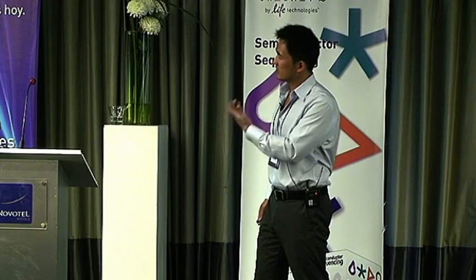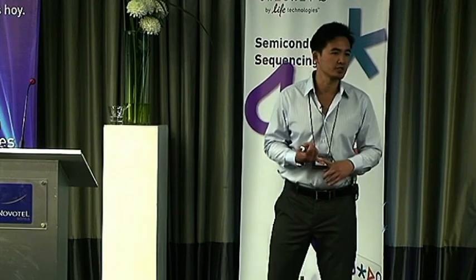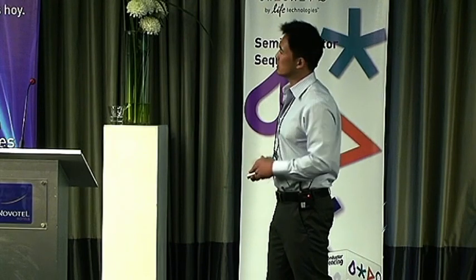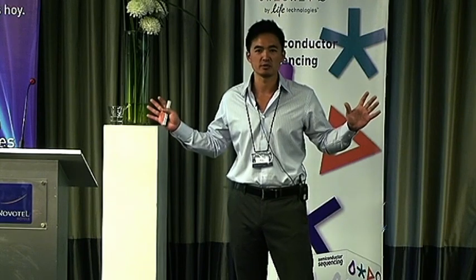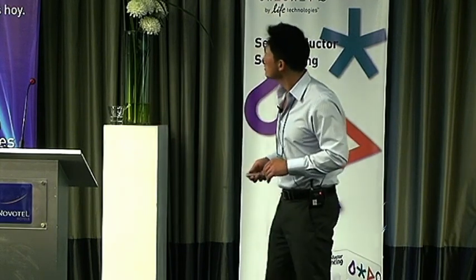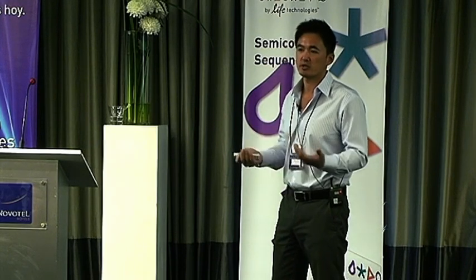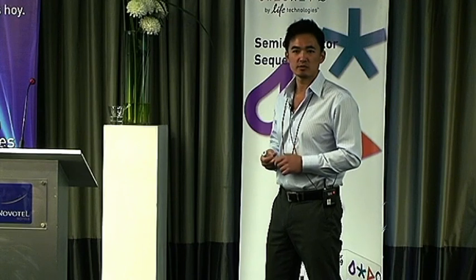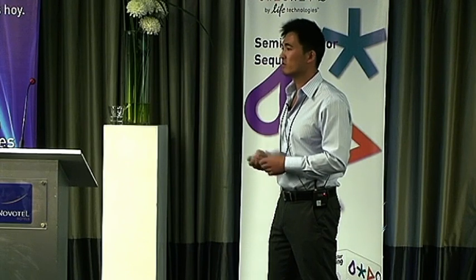The throughput is achieved, it's illustrated better, I think, here. So if we say this is a single instrument, this is a single researcher running this project, with one machine, basically you could come in at 9 o'clock, basically load up 4 of these arrays. Remember that the green section of this graph, right? This is the machine doing the cycling. You're not doing anything at this point. You're on the internet, Googling things. So basically what happens is the workflow is just this part right here. It's just 15, 20 minutes of preparing the array, setting up the machine, so forth. So there's a lot of downtime where the machine's doing all the work.